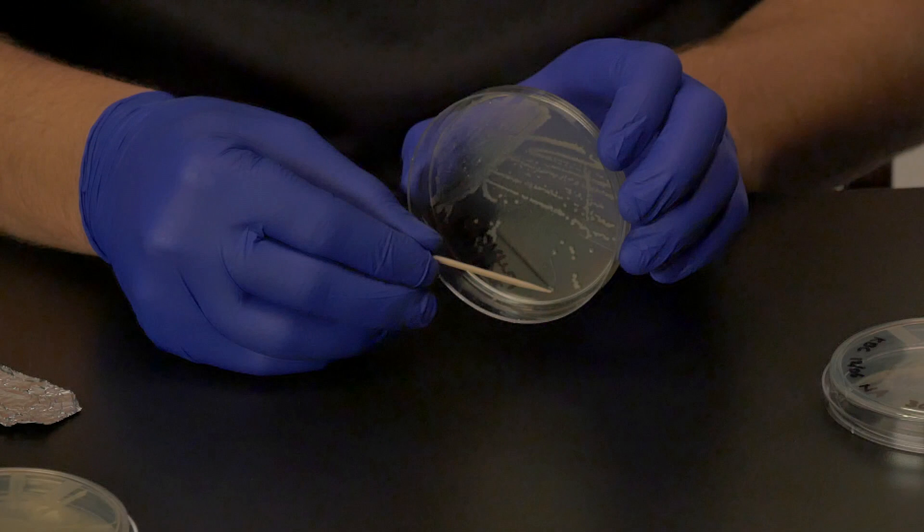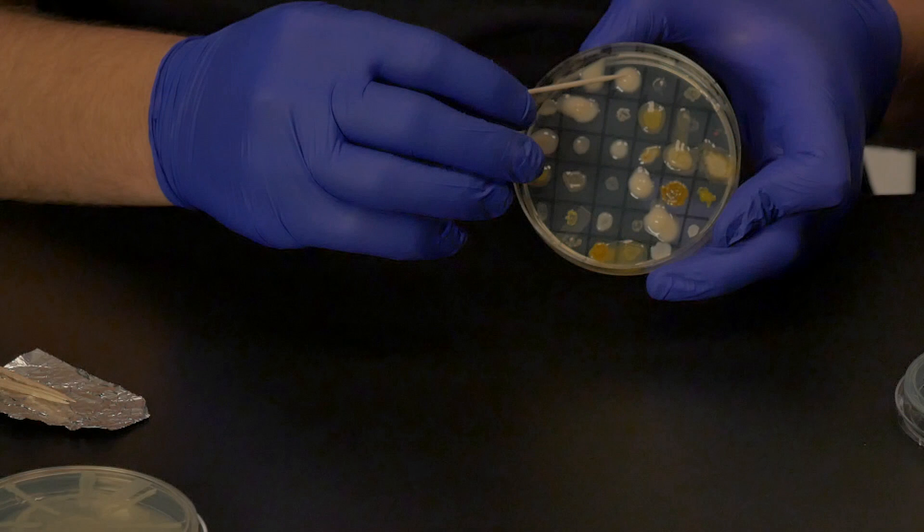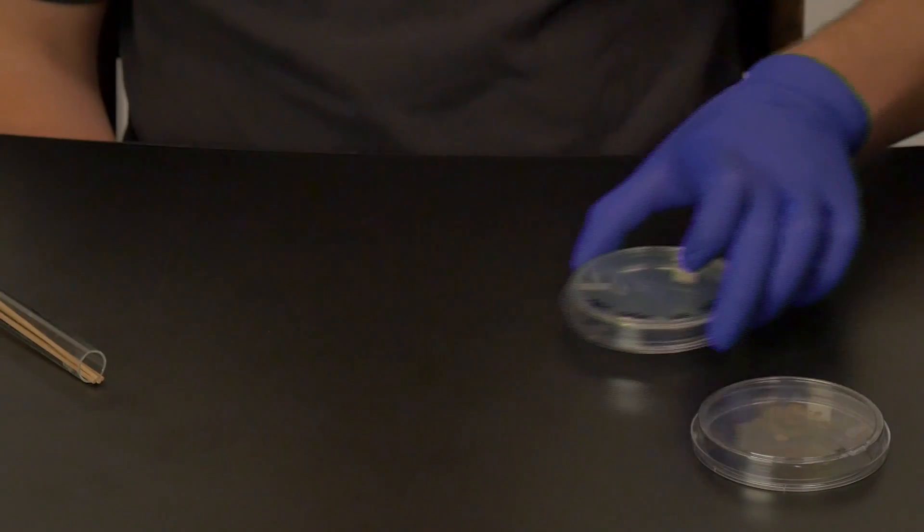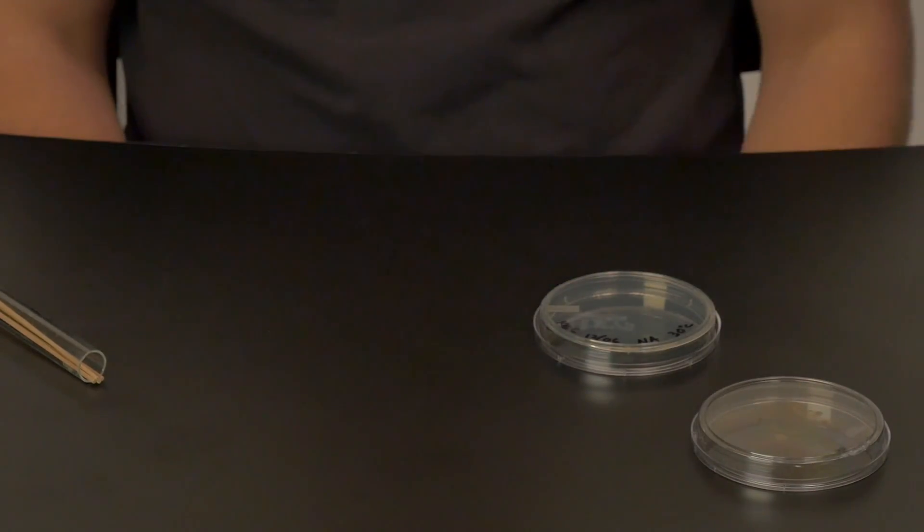You will now transfer your soil bacterial isolate in addition to a positive control and a negative control. The positive control is a bacterium that produces a zone of inhibition against this escape pathogen. The lab instructor will indicate what positive control we will be using in lab. This is a bacterial isolate that has been tested against the escape pathogen under the same conditions that you are using it, and it has previously demonstrated a zone of inhibition.